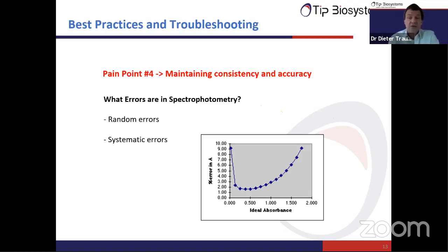Random errors arise from certain uncontrollable things in the environment and so on. They are a little bit difficult to reduce. They always happen. They're usually not that big. One way to get rid of them is to do repeated measurements of the same sample and taking an average of those measurements. So more serious are systematic errors.